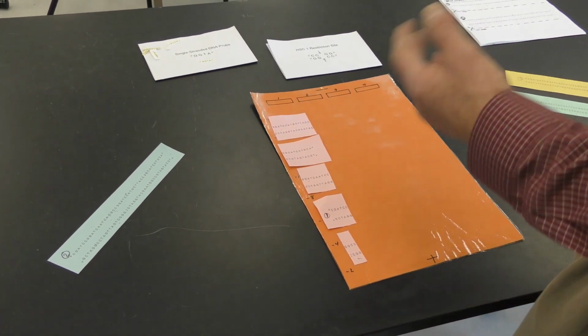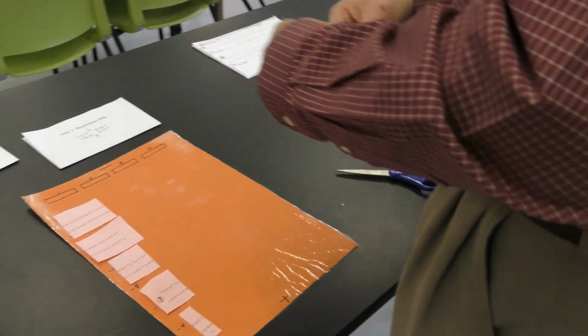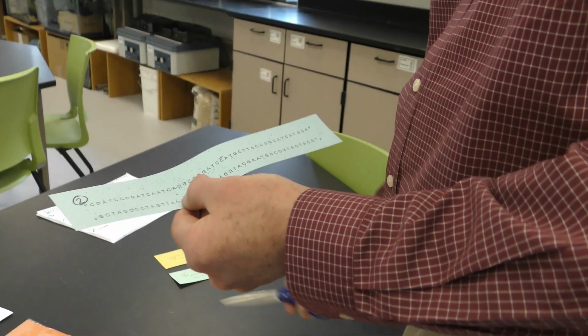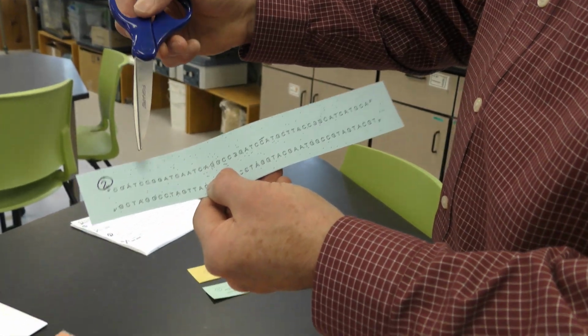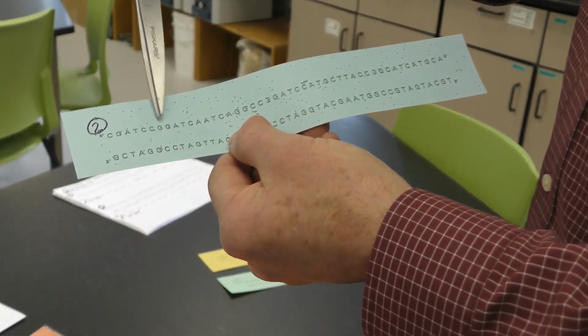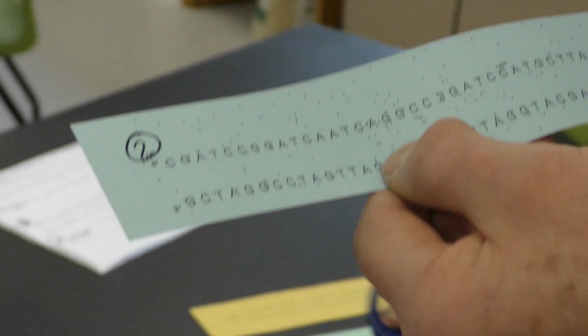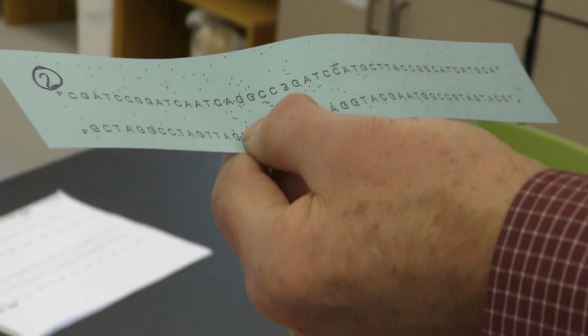Now, you want to repeat this exercise with each one of these DNAs. This is DNA 2. Again, you would go through there and look for specifically where you find the double C, double G on the 5' to 3' end, and make your cuts like we did for DNA 1. Then arrange the fragments generated from DNA 2 in a lane right next to it and compare. Okay.